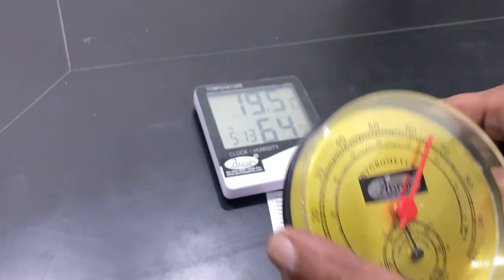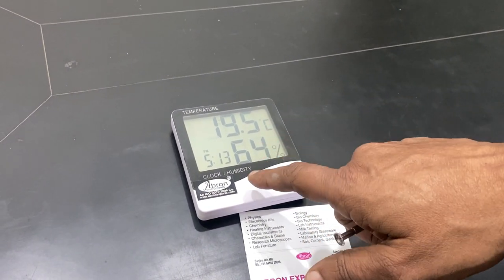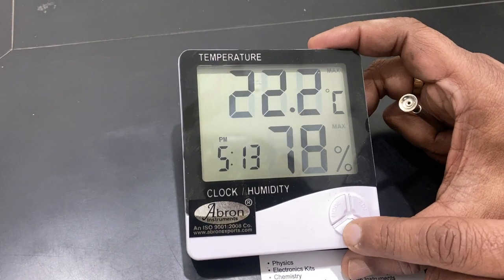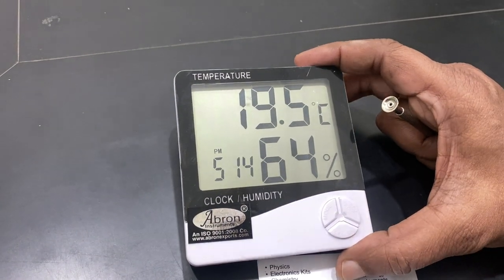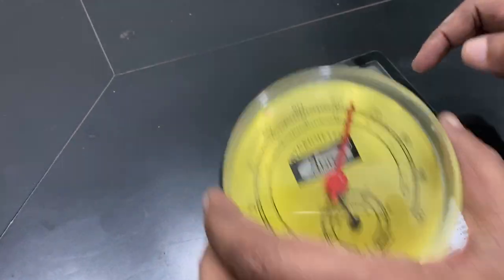If you want to calibrate it with any standard, we have got another digital model. This digital model shows the maximum and minimum readings. It's currently showing a normal 19.5 degrees temperature at 64% humidity, so I have just calibrated it with this particular already-calibrated instrument.